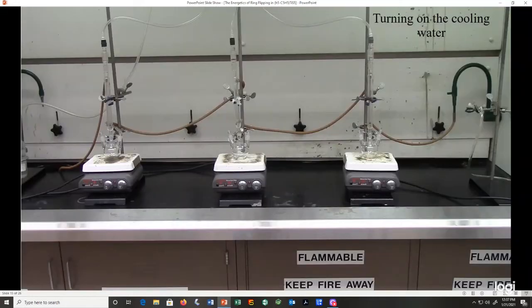So let's look at how we're going to turn on the cooling water. We're not heating this reaction, but it might generate a little bit of heat, so we want to make sure we don't lose any solvent. So we've connected the water line here to where it connects to the bottom of the first condenser, and then it exits at the top one. Then it goes to the bottom of the second condenser, up to the top of this condenser, and then to the bottom of the third one, up to the top, and then exits in the drain over here.